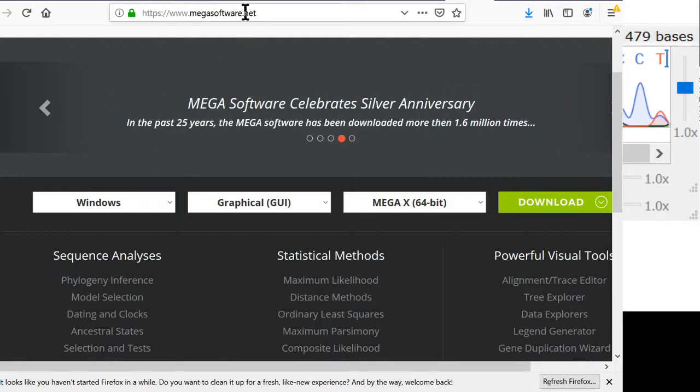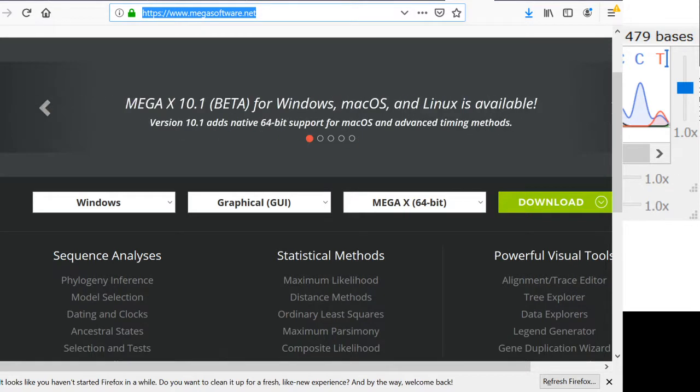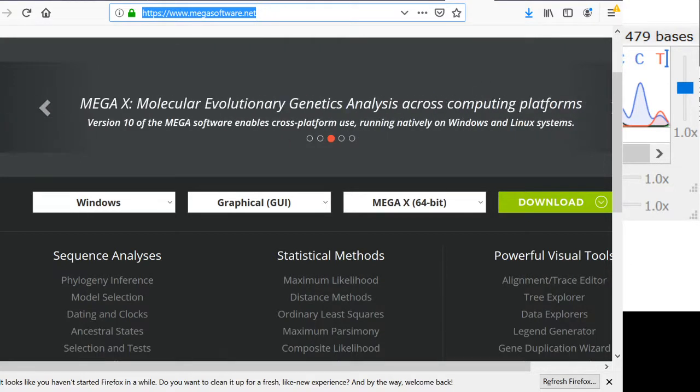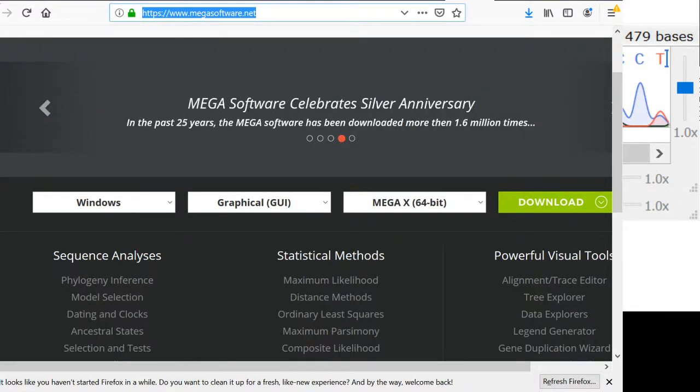And then if you're a professional, you use a program called Geneious. And Geneious is really cool. You can view the chromatograms like we did with SnapGene Viewer, except you can view the forward and reverse read at the same time and compare them in real time, which is pretty nice. But Geneious costs $500. But they've got a free trial for 14 days, and even after that free trial is up, it's still pretty good for a bunch of stuff. So those are the two programs that I recommend.